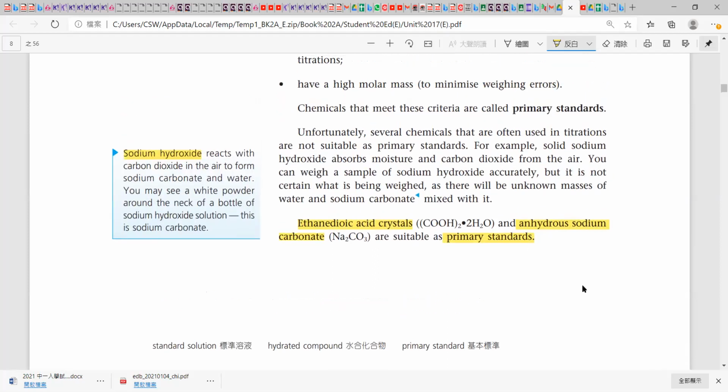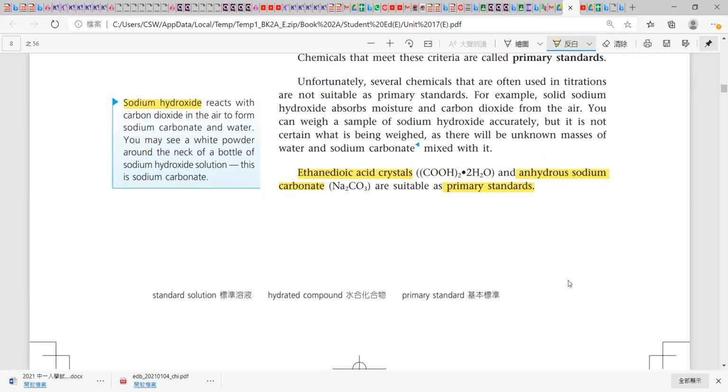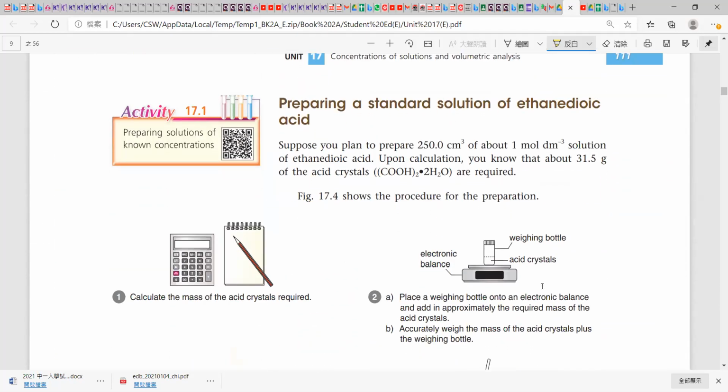Okay, primary standard, which means the chemical that can be used as the standard solution, simply by weighing accurately the solute and dissolve it in the known volume of solution. 跟唔跟到？係用落去個溶液度，已知體積嘅溶液，已知份量嘅鹽用落去水入邊，變成已知份量嘅溶液，得唔得？記住啊，我哋係唔需要度得準啊。最緊要係咩？個 solution 最後係有幾大個 volume 先。嗱，呢個先係最基本嘅嘢。Okay, is that clear?